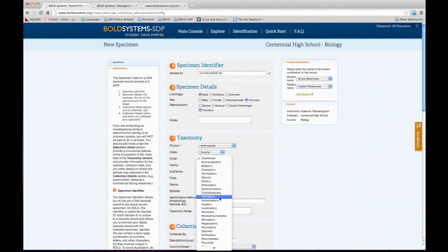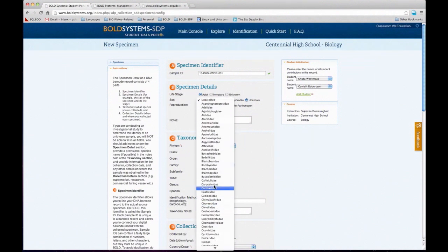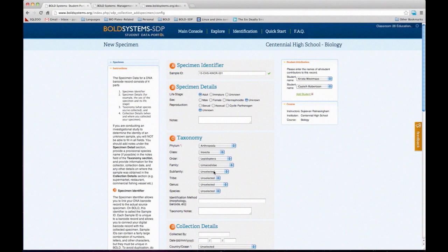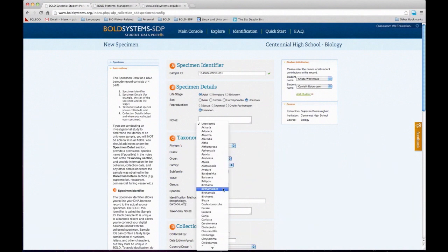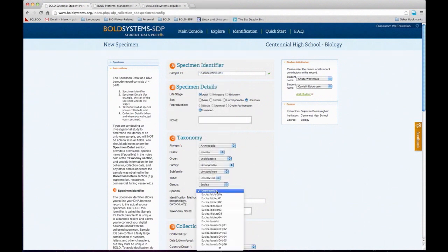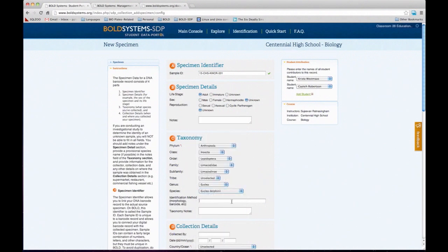Order — we have Lepidoptera. Then the family. And then the species. I identified this particular species based on morphology — just based on their physical characteristics. That's what I'm going to put there, and that's it for the taxonomy section.